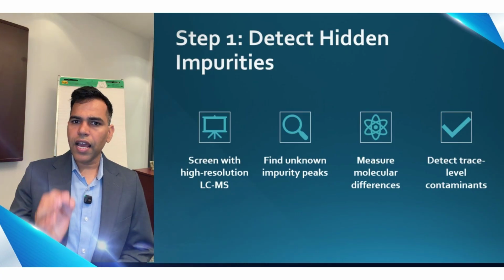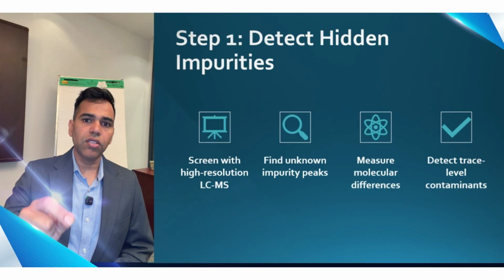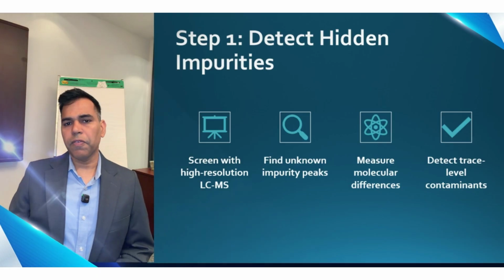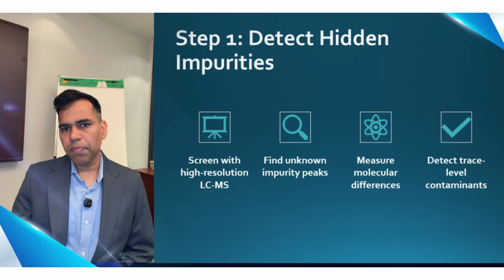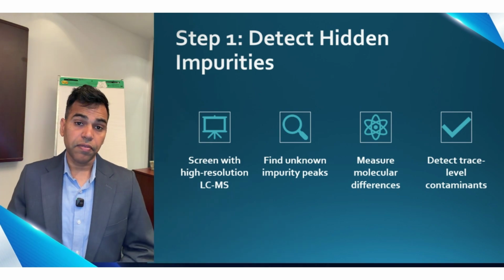The compound had not been detected by the existing method because it co-eluted with the main peak at UV wavelength. Finding it changed the development plan; not finding it would have changed the IND timeline.